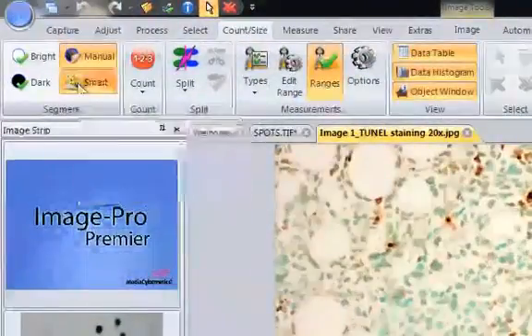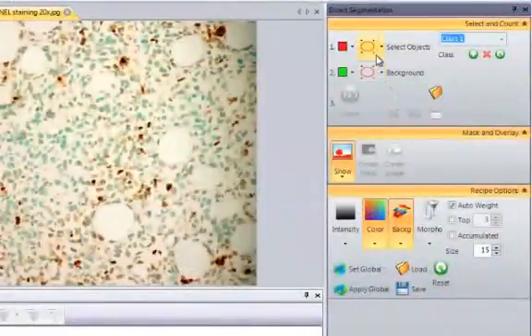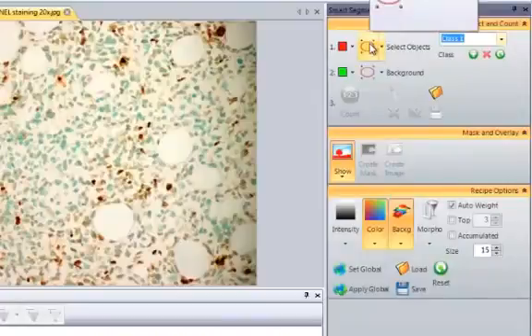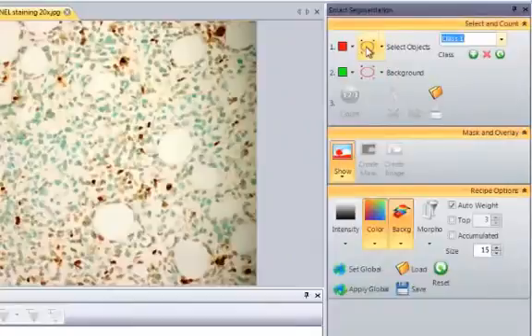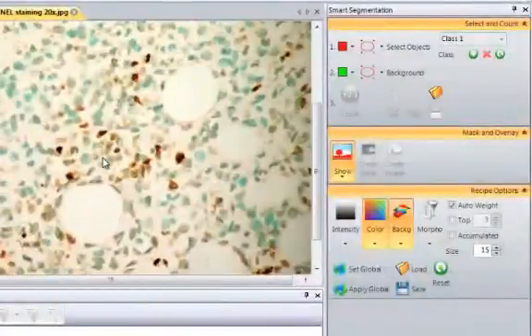Instead, we'll use a Smart Segmentation tool. Click on the Smart Segmentation tool, it'll just enable on the right. Here, we can define multiple classes if required. Select what constitutes an object in the class, what constitutes background, and when we're happy with count. I'm just going to zoom in first to see what we can do a little bit better.